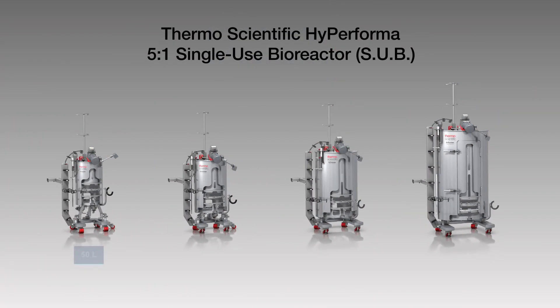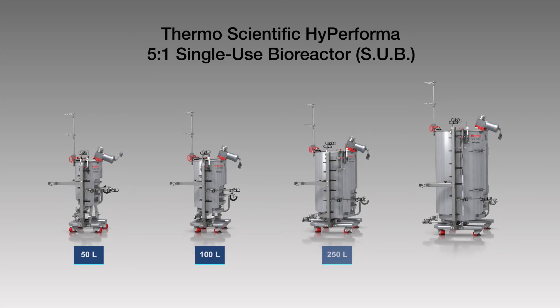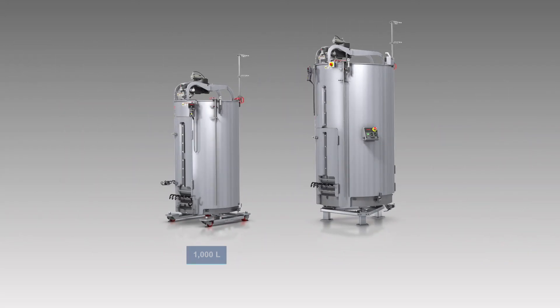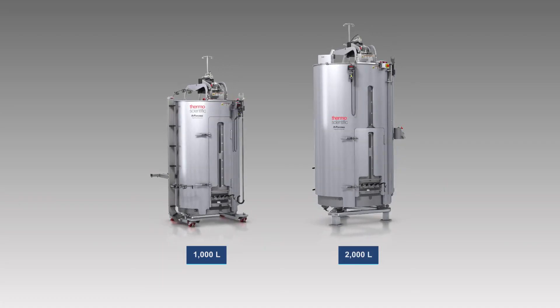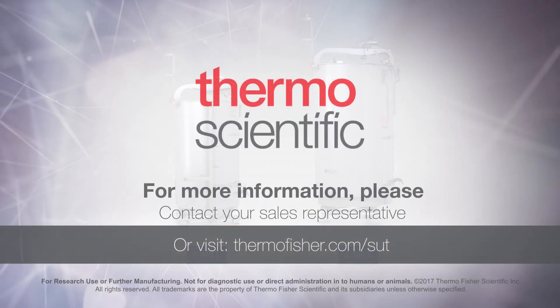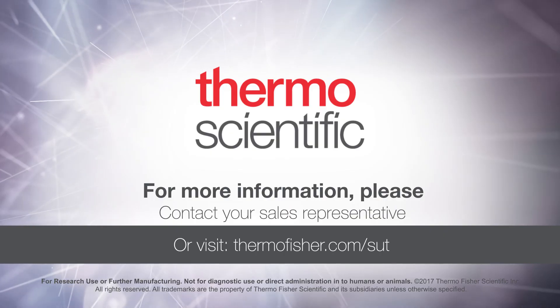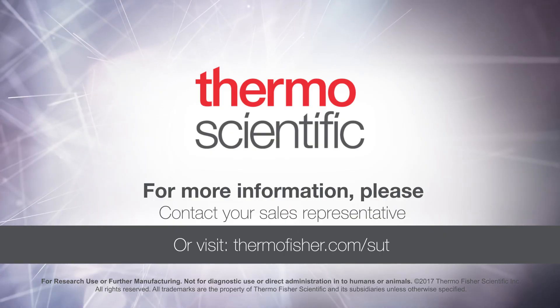Thermo Scientific Hyperforma 5 to 1 single-use bioreactors are now available in all vessel sizes, including 1,000 and 2,000 liters. For more information, please contact your sales representative or visit thermofisher.com/sut.